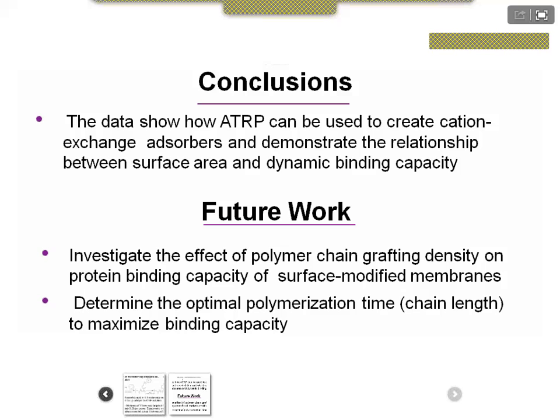What conditions could you change in the ATRP reaction to vary the polymer chain thickness? The polymer chain thickness is dependent upon the polymerization time. And so by lengthening the time, that will produce a longer chain.